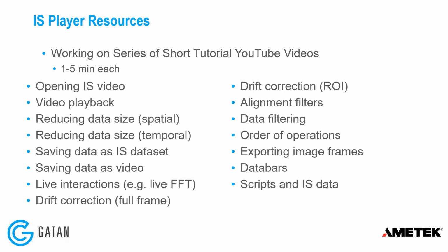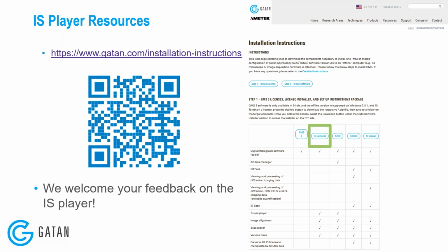And then we have some additional resources for the IS player. So I'm currently working on a whole series of short tutorial videos so that you don't have to wade through an entire hour-long presentation to learn about one of these features that you have a question about. So these will be going up over the next couple of months, and I'm excited about producing those short tutorial videos.